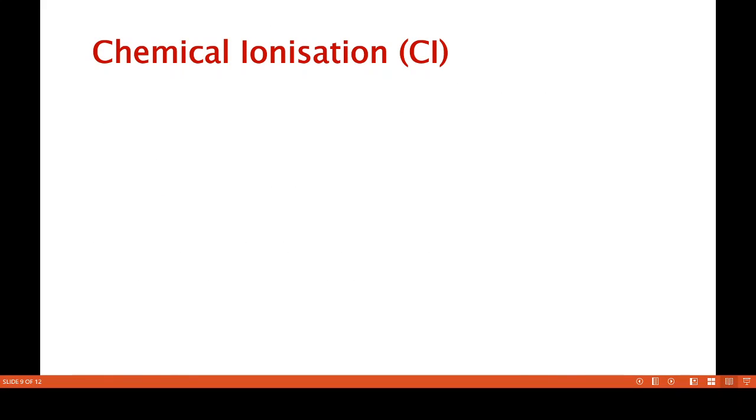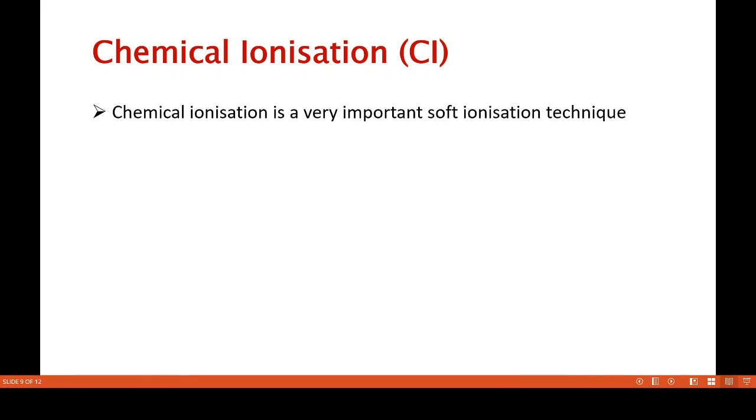Then immediately we start the second ionization technique, that is chemical ionization. In chemical ionization, we use a gaseous sample. This is a very important soft ionization technique.